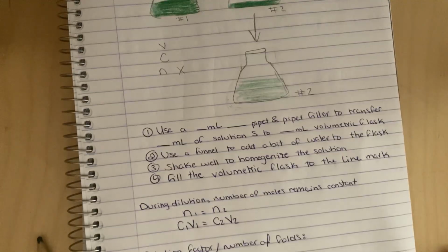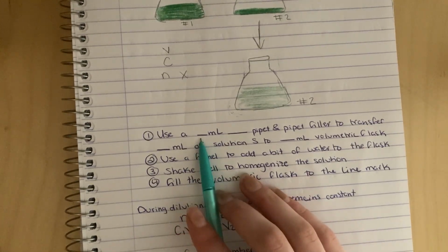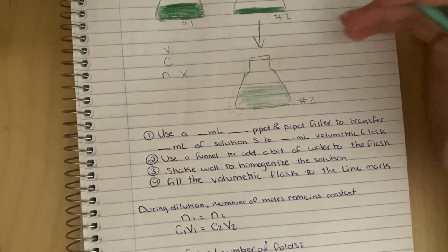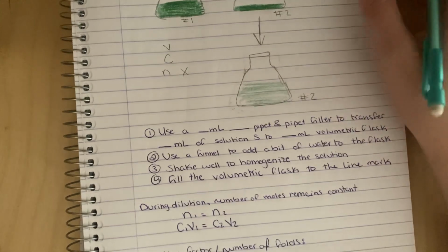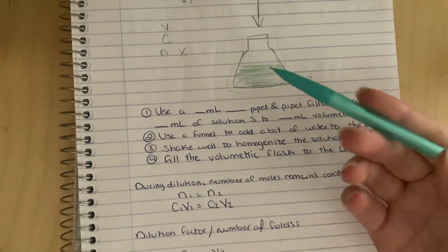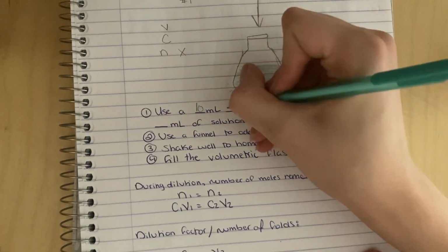So here are the actual steps of dilution. Everywhere that I drew a little line, you have to fill that in with the specific value that applies to this experiment. So let's say for this experiment we used a 10 milliliter volumetric.